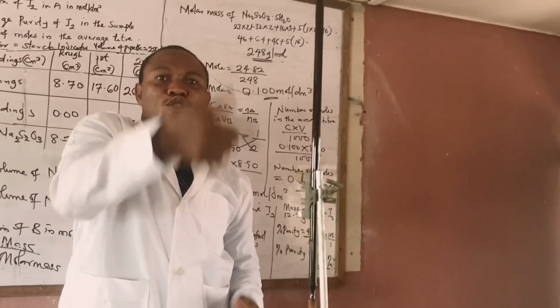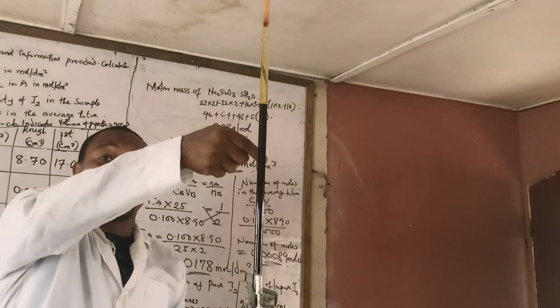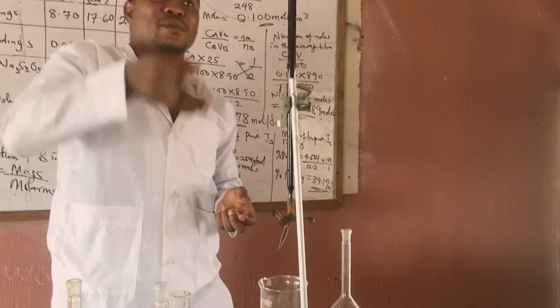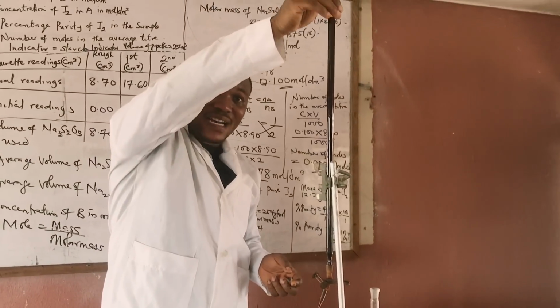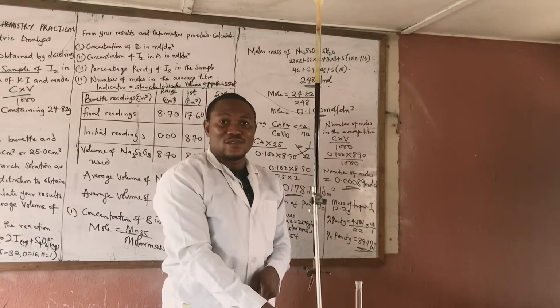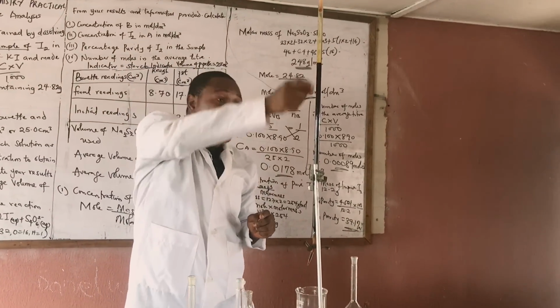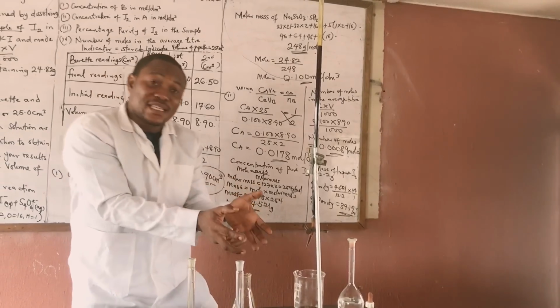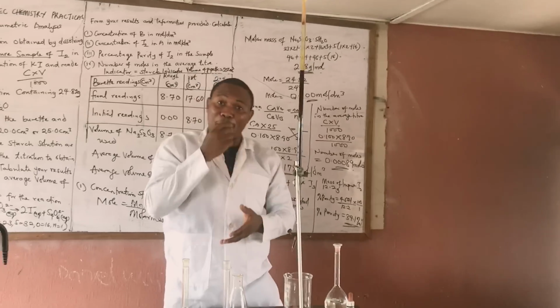But this is not what Waec asks us to do. I hope that is clear. This is not what Waec asks us to do because I've increased the concentration of potassium iodide here, and that's why you're having a reaction like this. But if I use the specification Waec gave me, using iodine here and titrating it against sodium thiosulfate, without adding anything, you will finish all the one in the burette and you don't have a change in color. And that's the reason why we are predicting that based on what they are giving us, it should be sodium thiosulfate in the burette, and you are pipetting iodine.